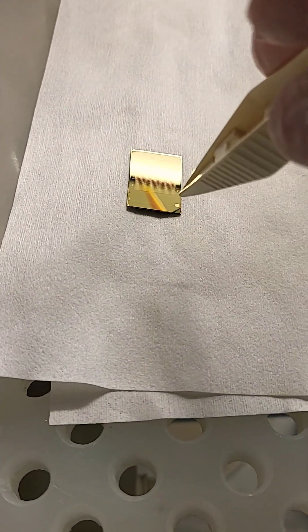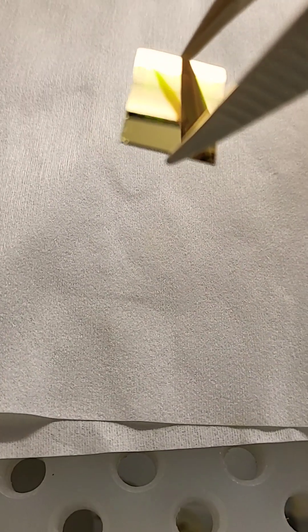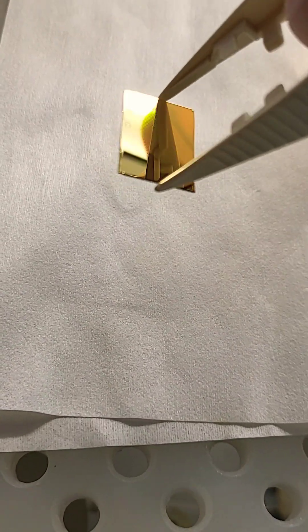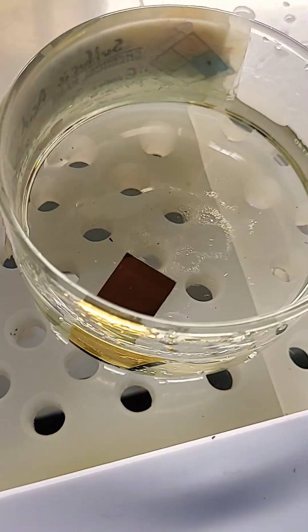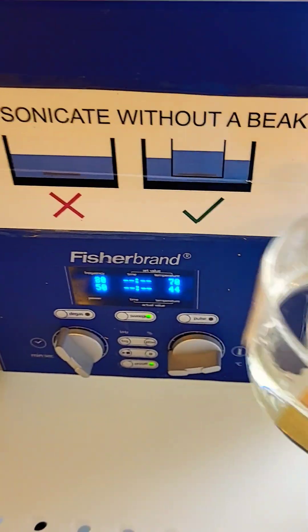So I have a chip. I just finished depositing the gold, and if you look on there, there isn't much to see. There's something on there, but I have to place it in this powerful solvent so that I can perform this lift-off procedure. So I'm gonna place it in a sonicator.